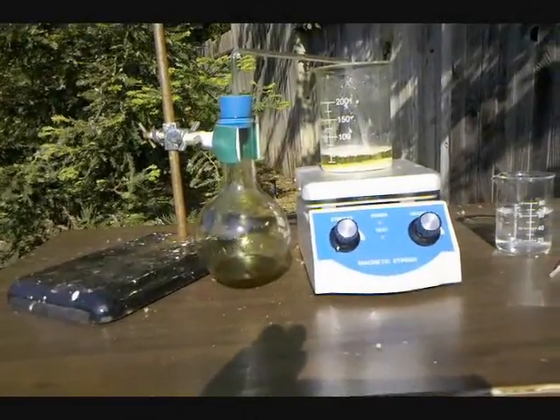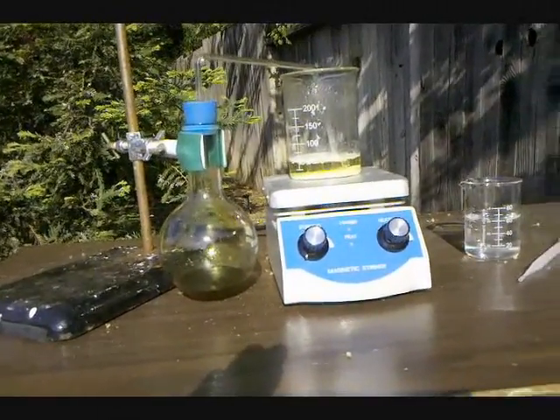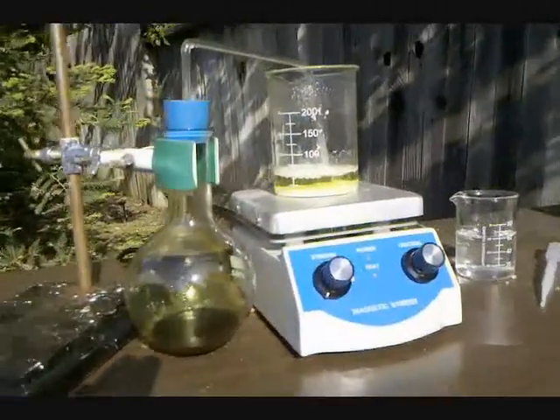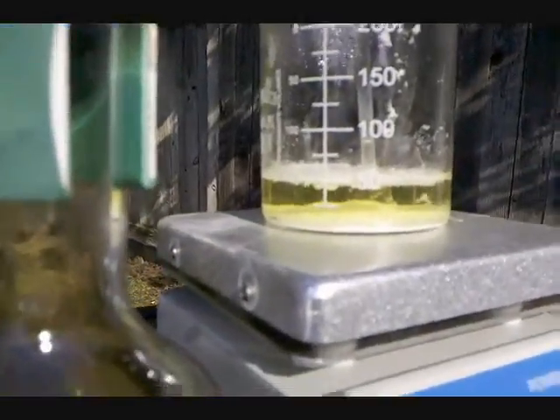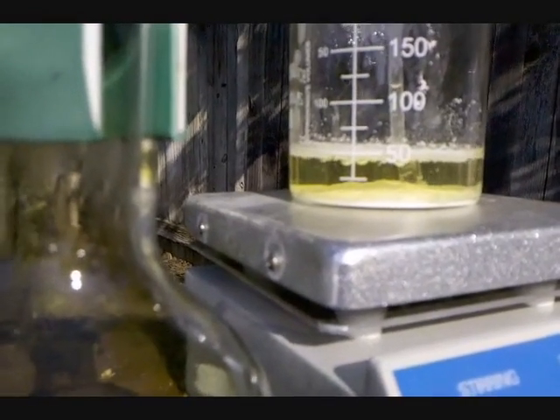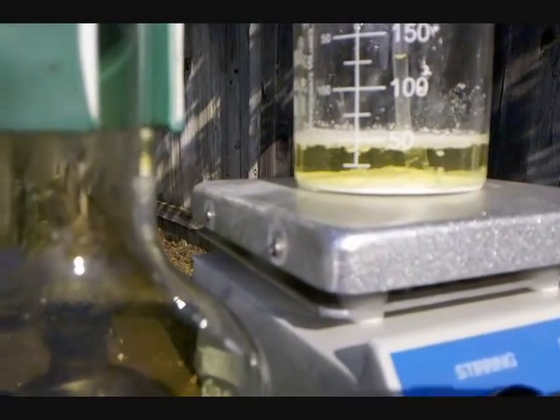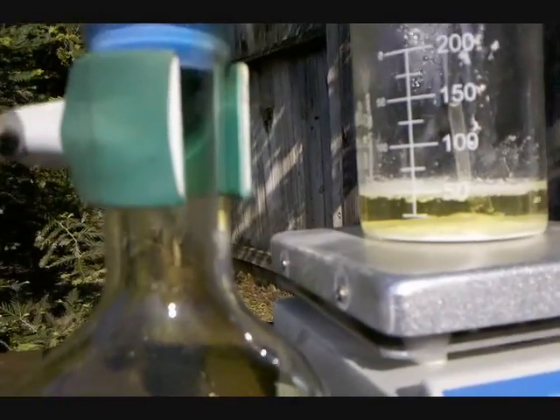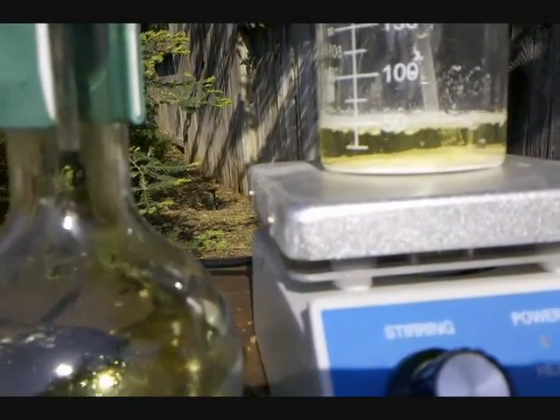Now it's been about a good hour and I'm about ready to finish here. One interesting thing to note is that I started with a little over 100 milliliters of water, and now I'm down to a little under 50 — obviously because I've been heating it and a lot has been evaporating away. There's a lot of precipitate down there now, so I think we are done.